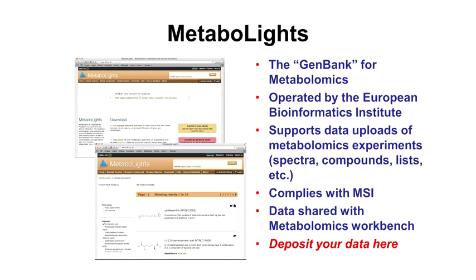MetaboLights is operated by the EBI in Hinxton in the UK, and it supports standard archival data uploads. So you can include experiments, the spectra, the lists of compounds, how you conducted the experiment, other metadata. It complies with the Metabolomics Standards Initiative, and all the data uploaded to the MetaboLights website is also shared with the Metabolomics Workbench as part of the COSMOS initiative.